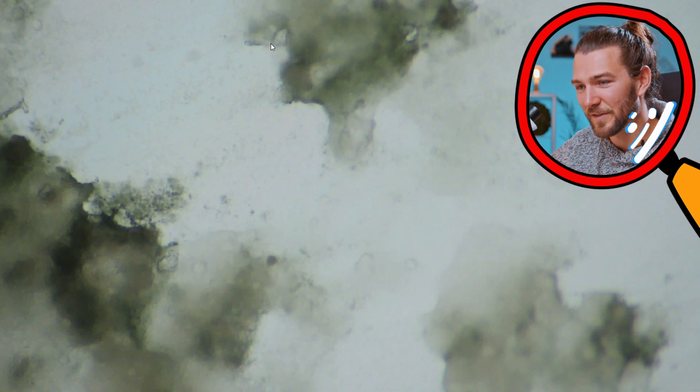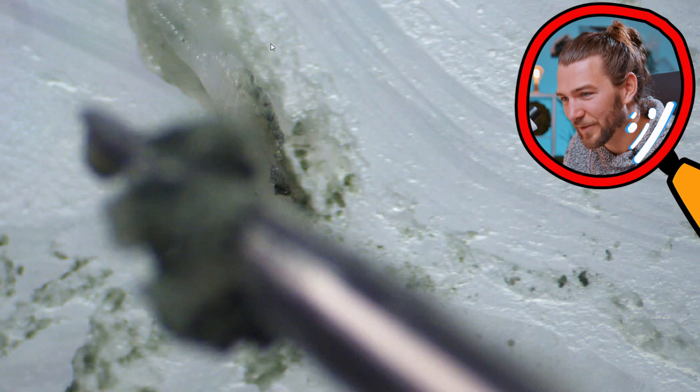Here you can see a little bit of the crystals and the texture of the mold and the cheese. Here I got a little bit bigger piece on this glass slide that I can poke around with.